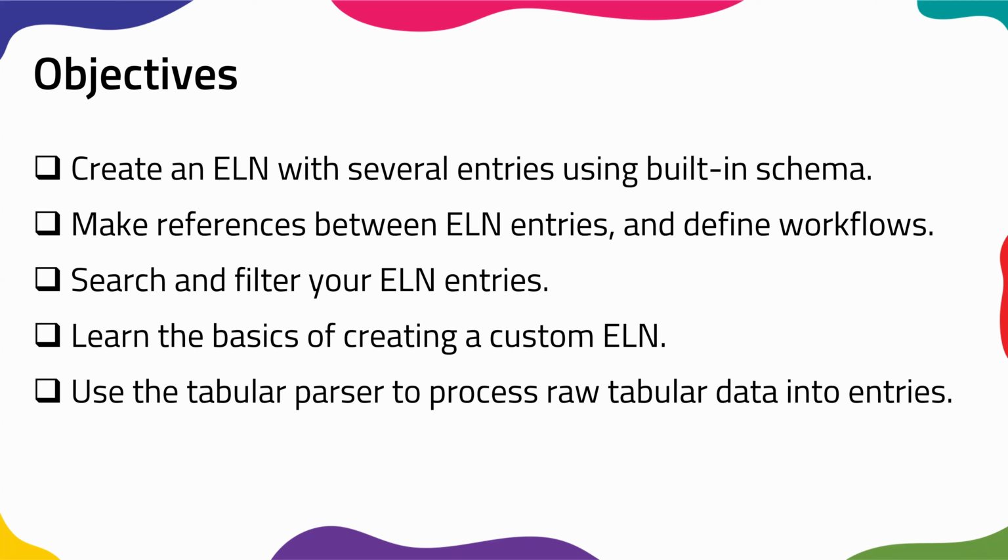scientific process. So for this, we thought we'd use NOMAD's built-in ELN templates to document the research process by making several entries. And that's what you'll learn. And then at the next step, we'll reference these entries together, basically interconnect these ELN entries together and define workflows.